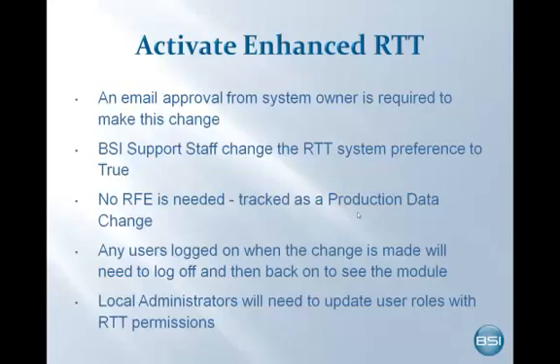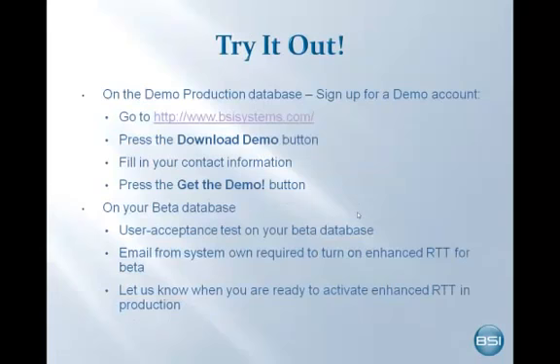Once the preference is set to true, local administrators will need to update roles with the Enhanced Requisition Task Template permissions. Any currently logged on users will need to log off and back on to see the changes. Prior to turning on the Enhanced Requisition Task Template functionality, we encourage you to try it out, either on the BSI demo database or your beta database.